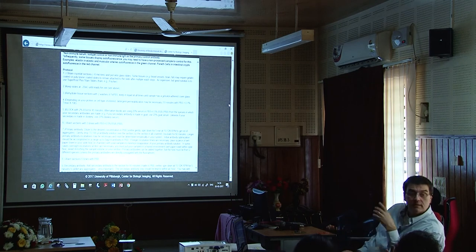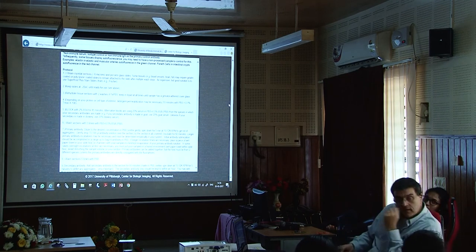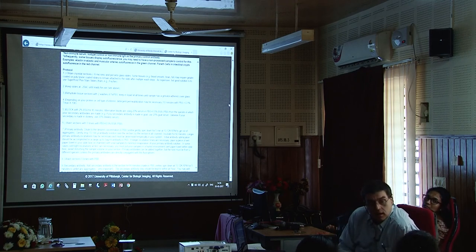Okay, so, yes? For rehydration, the first time we are using distilled water for washing is good? No. For the rehydration, we are using distilled water.